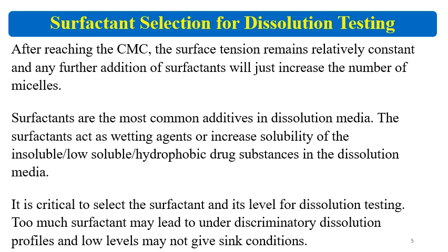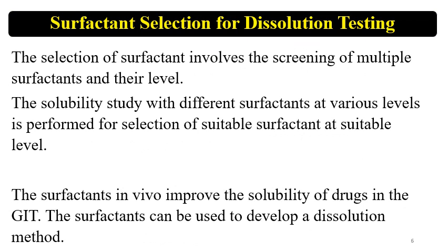Sink condition is recommended for reliable dissolution testing. So the surfactant should be used at such a level that the sink condition is met, the dissolution is reliable, and the dissolution is complete. Those points we are going to understand in detail in the upcoming slides.